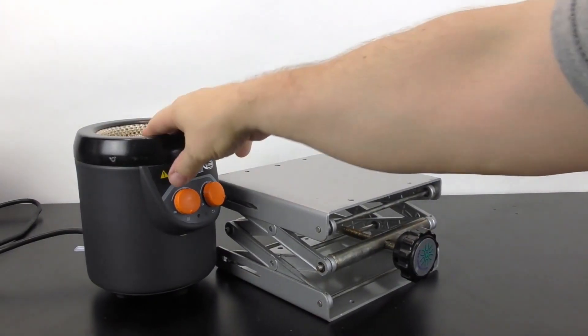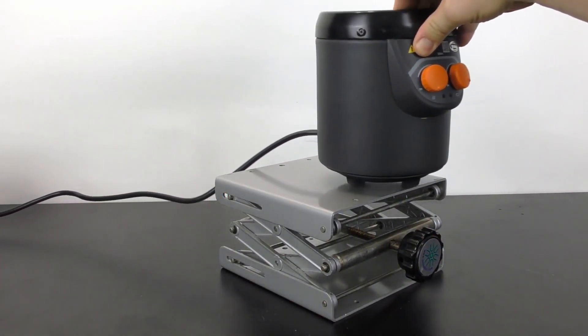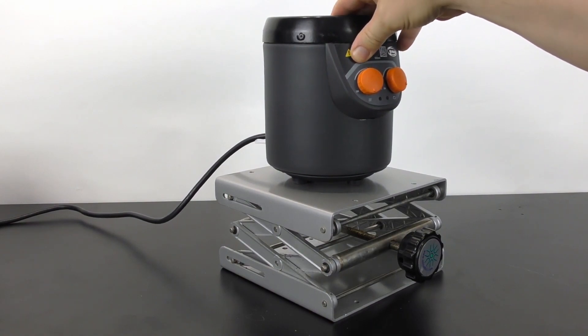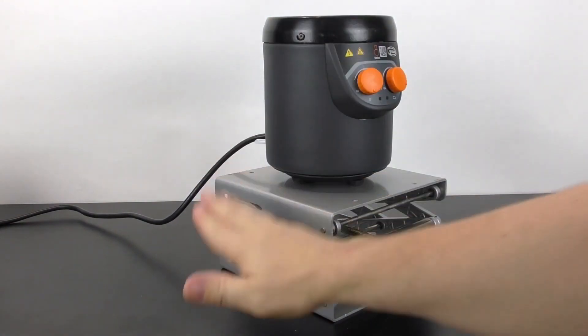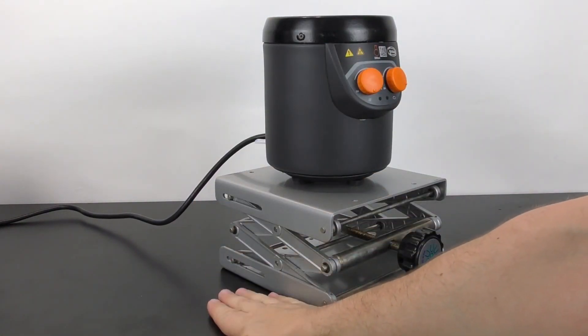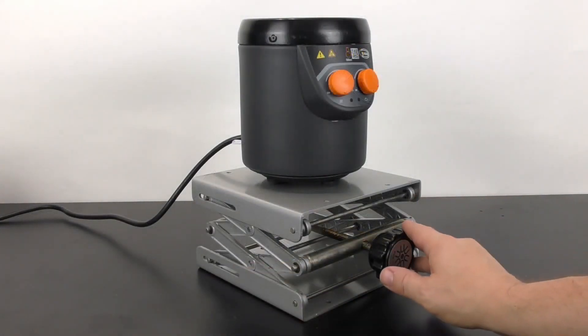When you're placing equipment on the lab jack, make sure you place it on the center so it is the most stable. Also make sure you're putting it on a stable tabletop.